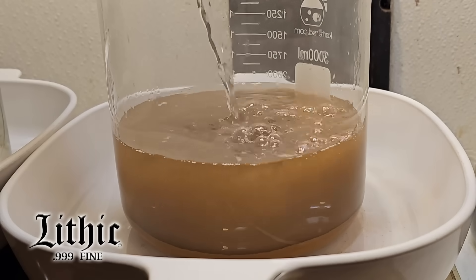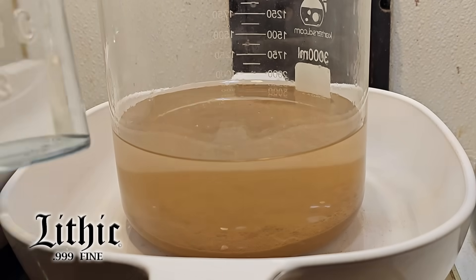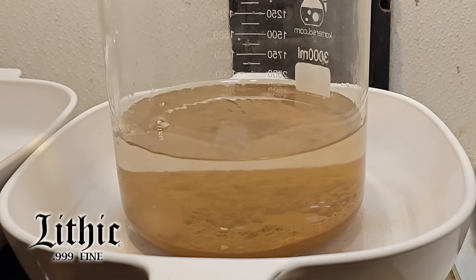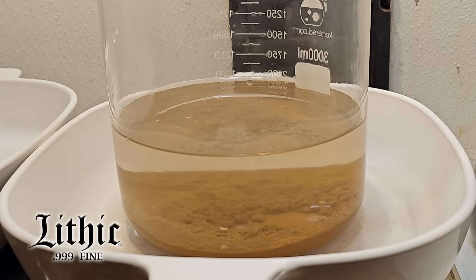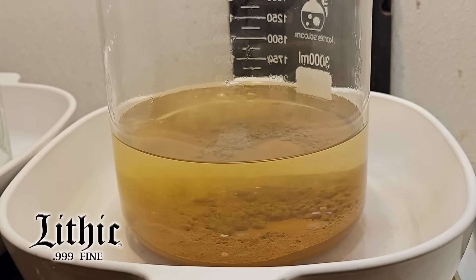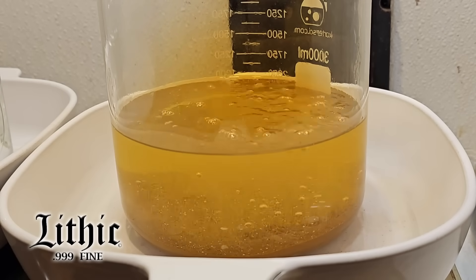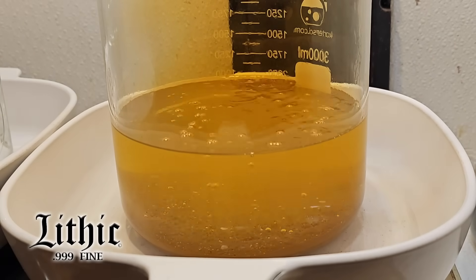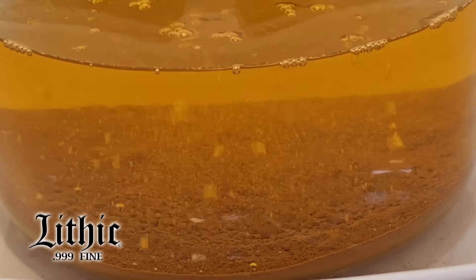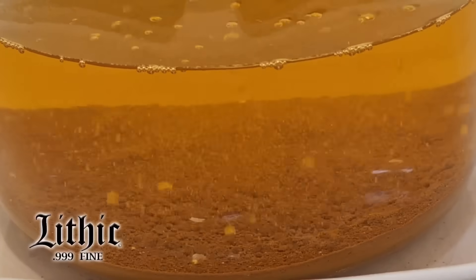I added more hydrochloric acid and we're going to put this gold sponge back into solution again. Here we have concentrated nitric acid — we introduce that into our solution, get the heat going, and the gold goes back into solution. The reason I do it twice is because I know trace elements are being dragged along, and doing it twice lets me pull the vast majority of those out.